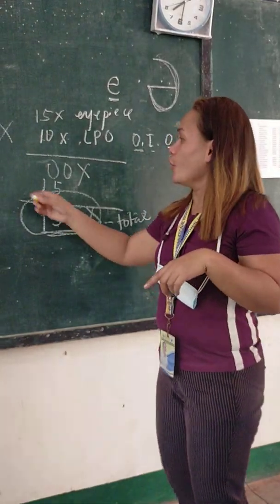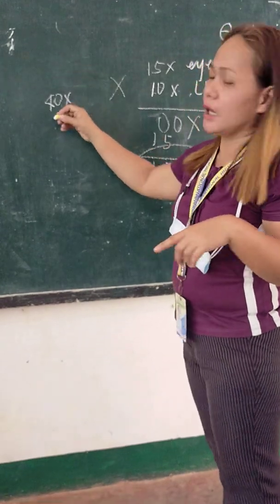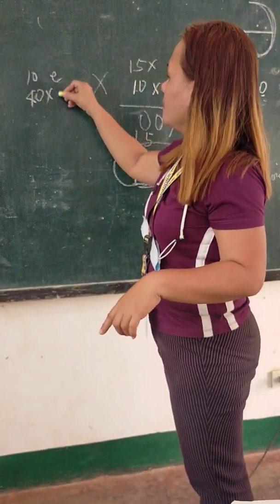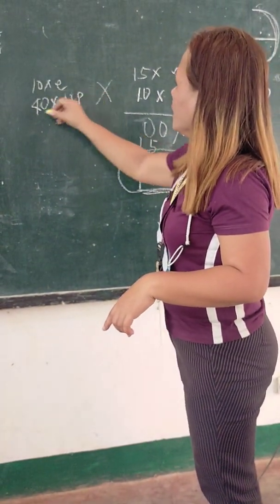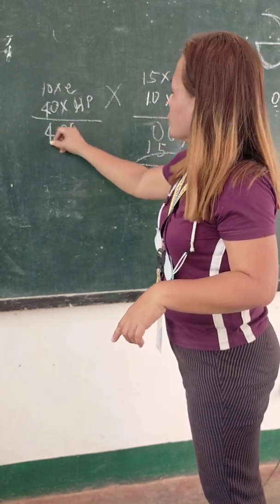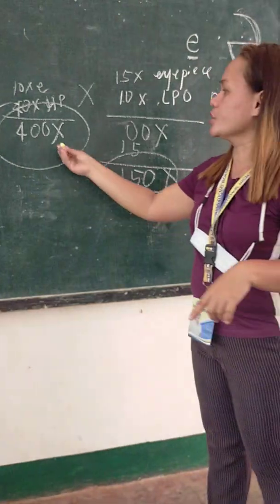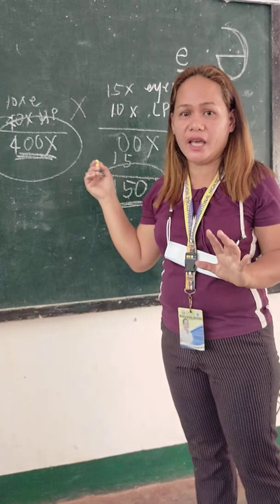Okay. For the high power objective, for example, your eyepiece is 10 times and this is your HPO, 40 times. Just multiply that: 400. So you are magnifying your sample up to 400 times. See?